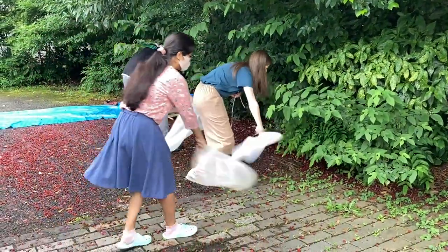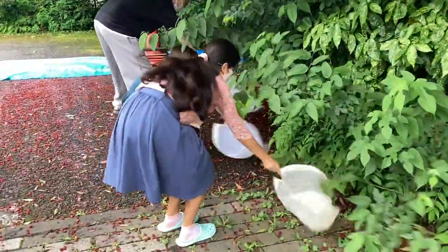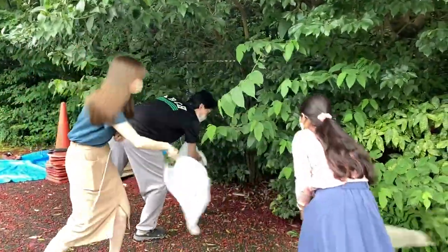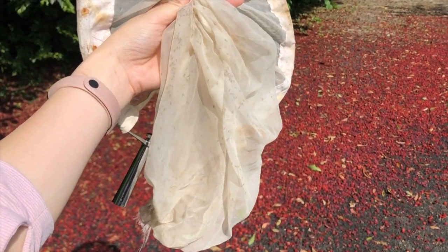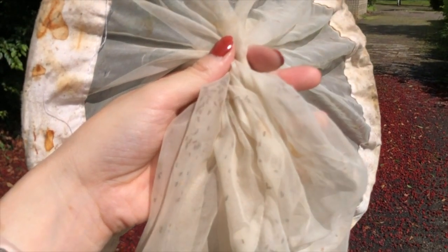Repeatedly sweeping the net around the fruit can collect flies. If flies are gathered in the net, turn the net opening down, and the flies will move upward on their own, collecting them at the tip of the net.